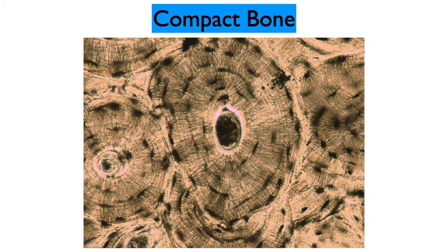And they are kind of demarked because there are clefts between the lamellae where the osteocytes, the actual bone cells, are going to reside. And so the bulk of the lamellae are actually made up of a matrix that is going to become impregnated with minerals like calcium to strengthen, to provide the structural integrity of the bone.